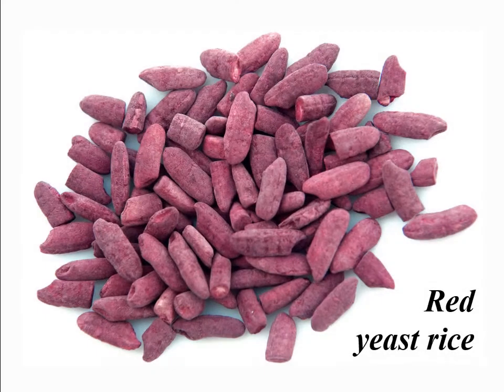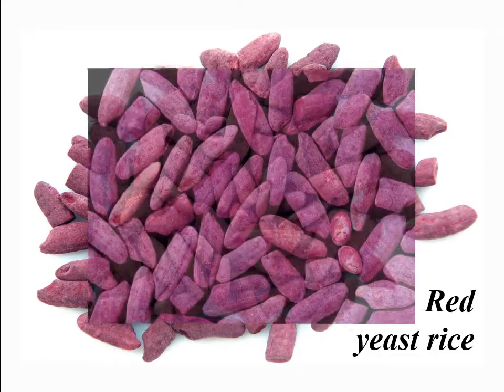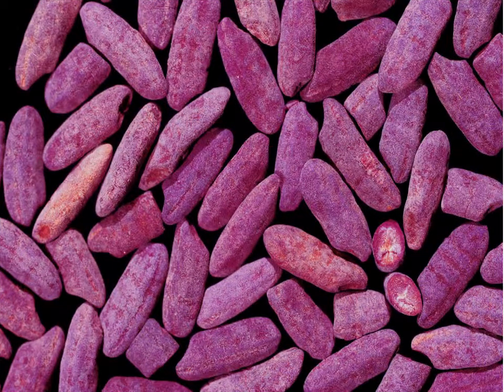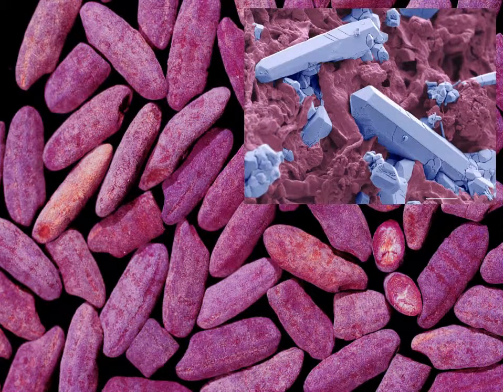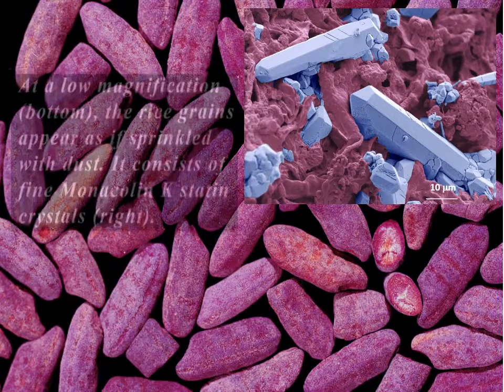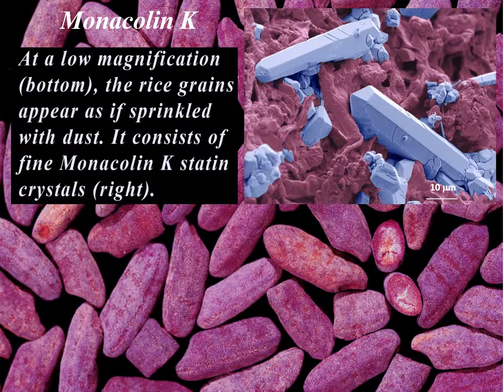In Asia — particularly China, Japan, Indonesia, and the Philippines — some cooked rice is fermented with a yeast called Monascus purpureus. It gives the rice a pleasant flavor and a red color, which may be used to tint pickled tofu, vinegar, many Chinese pastries, and also Peking duck. The fermented and then dried rice appears as dark red grains. Some fragments show light interiors, meaning the yeast have not yet reached the grain center. Scanning electron microscopy shows nicely developed crystals up to 100 micrometers long on the grain surfaces. The crystals consist of monacolin K, which is identical with lovastatin — a medical substance from the large group of statins used to regulate lipid metabolism in humans.